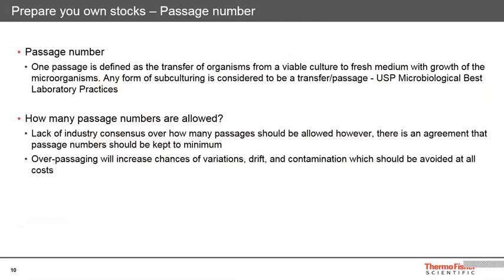How many passages are allowed is a question for discussion. There is some different guidance from different regulatory bodies across multiple industries such as pharma, clinical, and food or water regulatory bodies. However, there is a mutual agreement between all of them that the passage numbers should be kept to the minimum. The more subcultures performed, the more chances for genetic drift, contamination, and mutations from the original strains, which we should avoid at all costs.